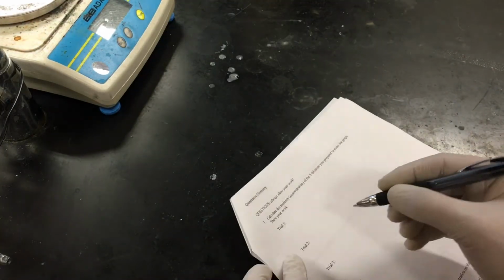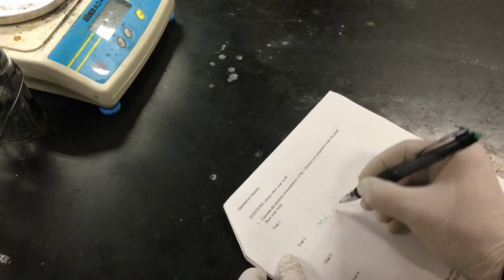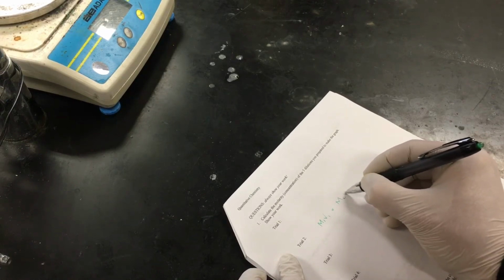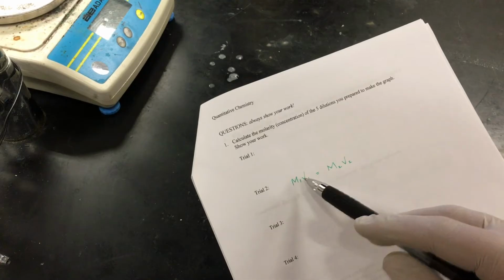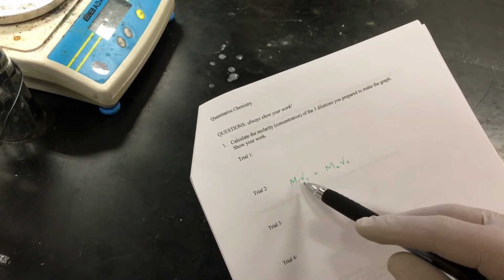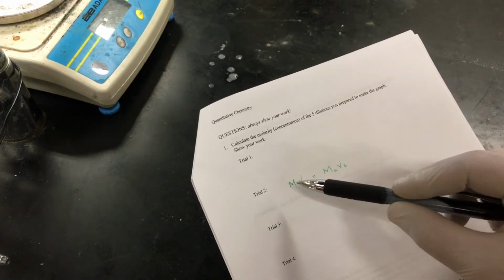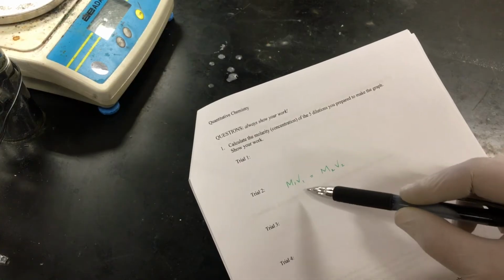So this is trial number 2. And the dilution equation is M1V1 is equal to M2V2. Now, concentration and volume in the original state, one means before we added the water. So what was the concentration of the solution before we added the water, and what was the volume of the solution before we added the water?